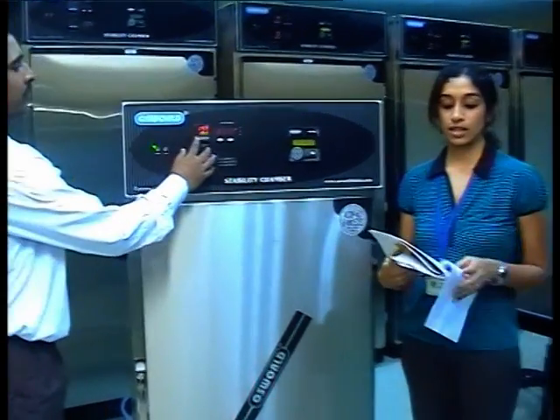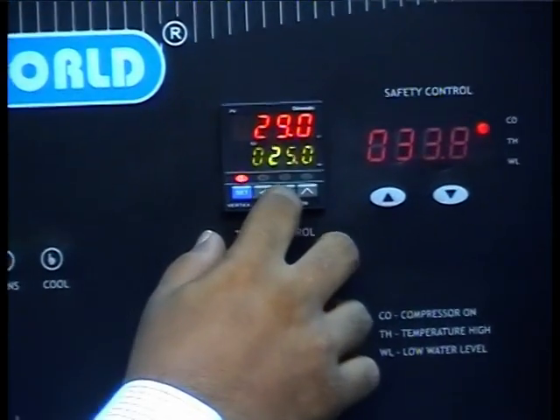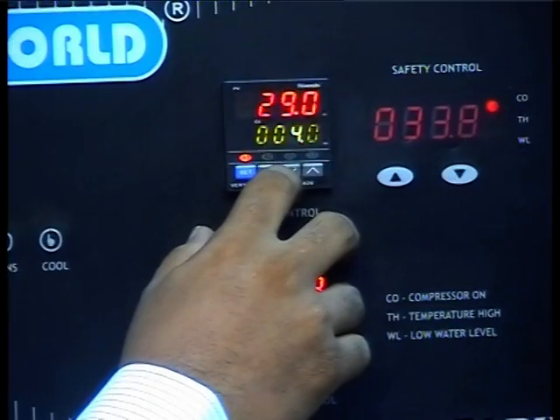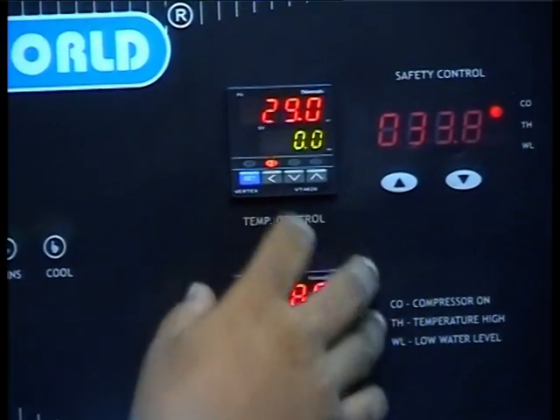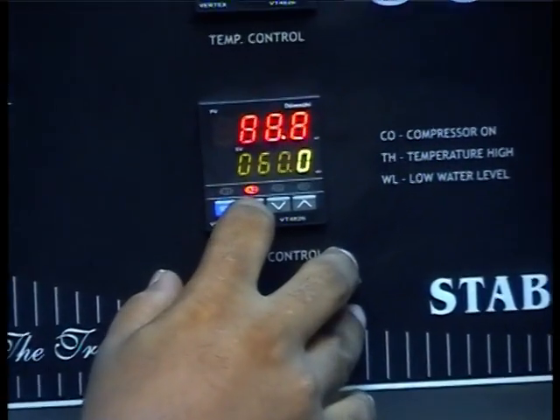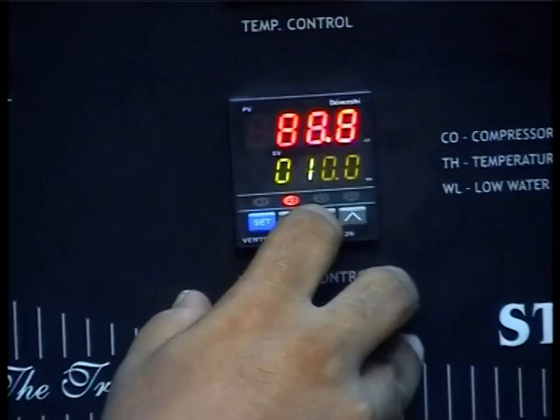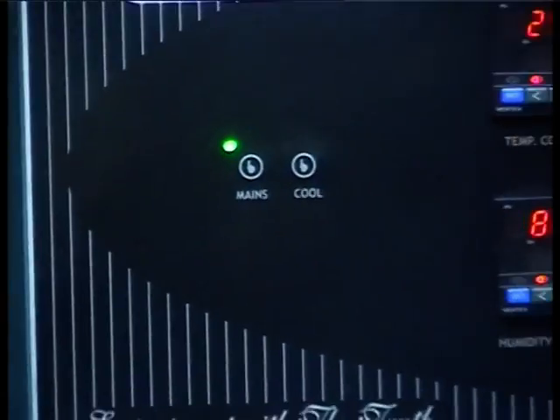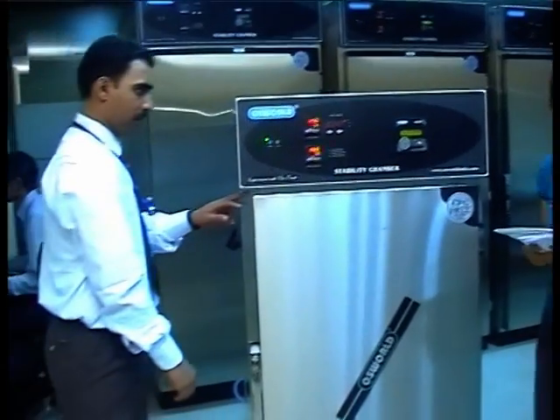And finally, the third test. This test is to confirm and establish that the temperature sensor and humidity sensors of the stability chamber are functioning normally. Firstly, set the temperature controller to 0 degrees Celsius or its minimum value. Set the humidity controller to 0% or its minimum value. Switch off the refrigeration system. Keep the main door and the inner glass door wide open.